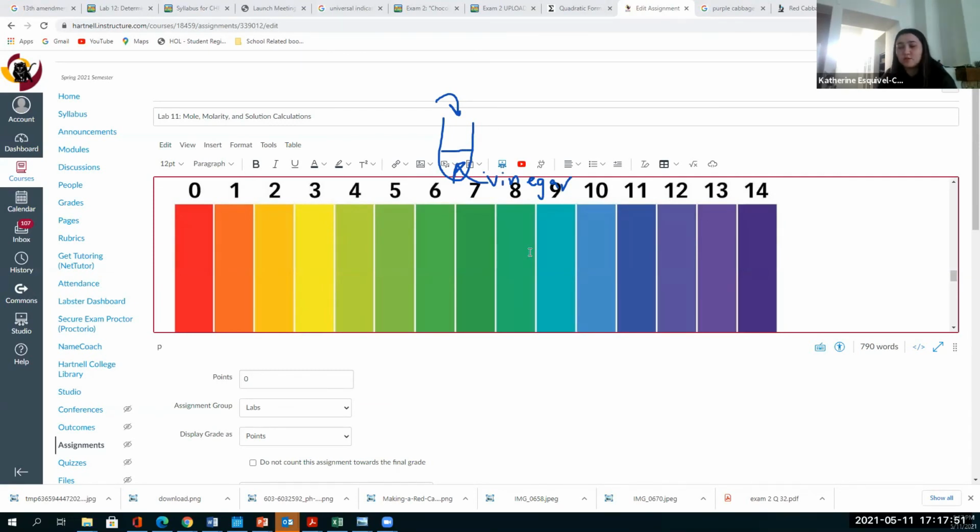And then I was supposed to do it with the vinegar one? Yep. All you have to do is take straight vinegar, put a little bit onto your strip, and you're good to go. And then you do the same thing with the Kool-Aid.